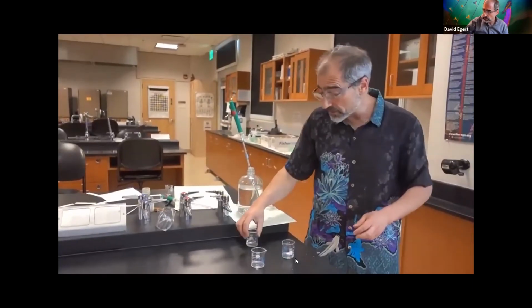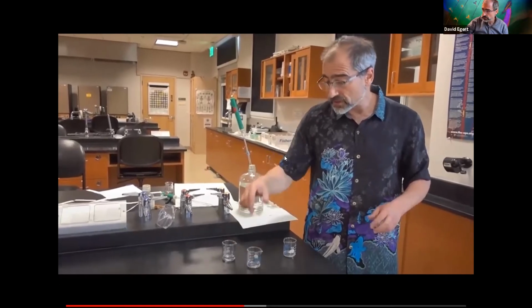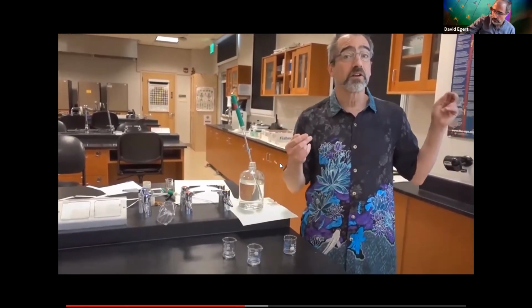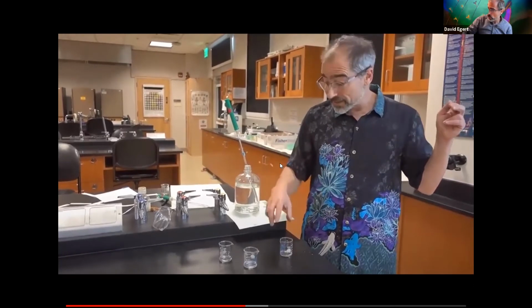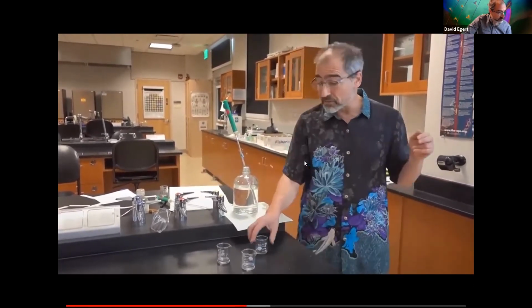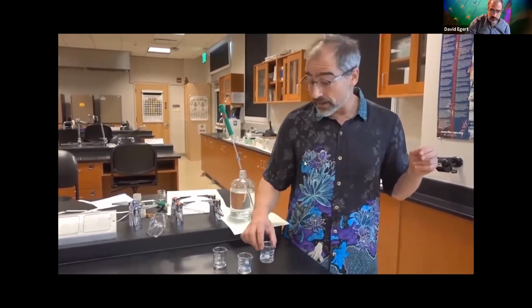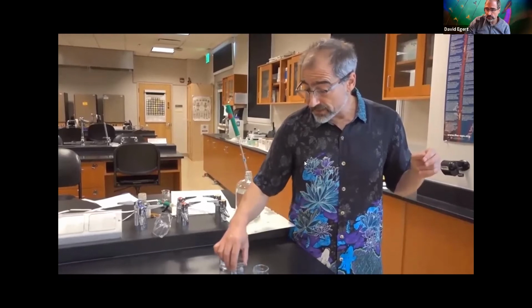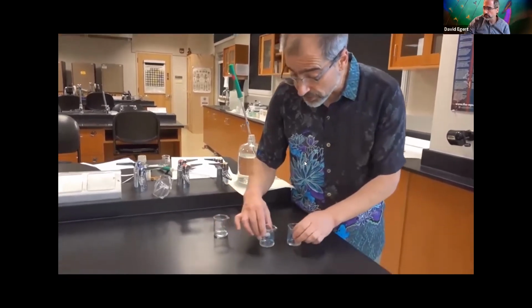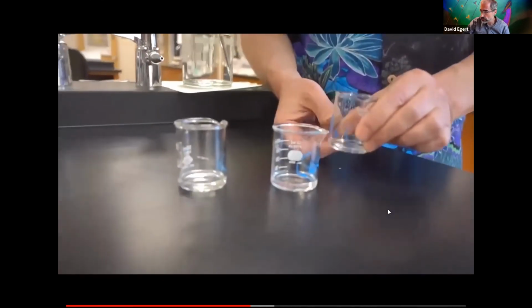So here we've got all of our electrolytes. And again, electrolytes, you should know what it means to be an electrolyte. And what do potassium chloride, sodium chloride, calcium chloride all have in common? And I've just mixed them with water. And now, take a look.